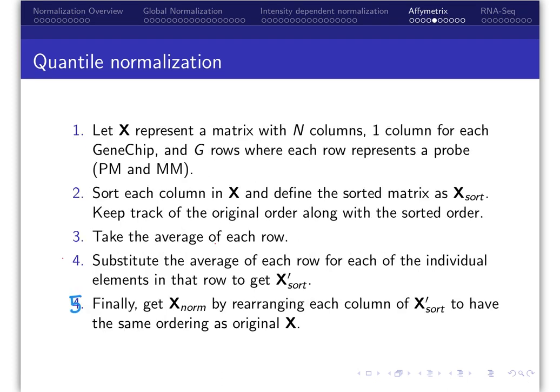Quantile normalization, which is now the most commonly applied normalization method, assumes there is an underlying common distribution of intensities across gene chips. A QQ plot can be used to compare if two gene chips come from the same distribution. If so, the points will fall along the diagonal.